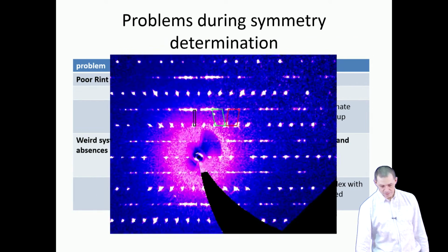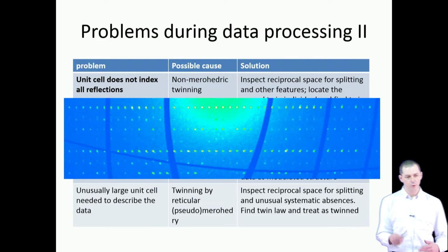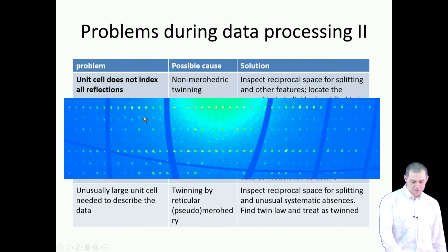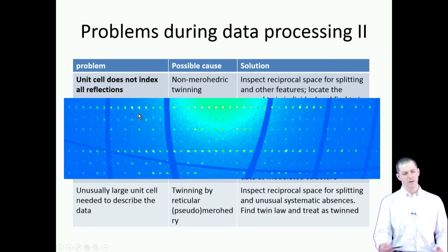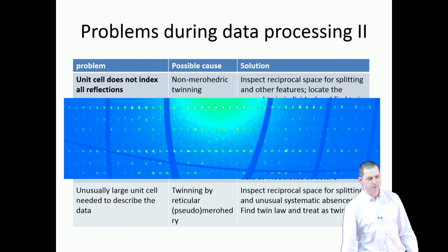On the other hand, if you have an incommensurately modulated structure, which is this case, then you see that this distance here is a little bit more than 1/2, this distance a little bit less than 1/2. So it's not a simple fraction. It's not 1/2, it's not 1/3. And then this structure would be considered incommensurate.